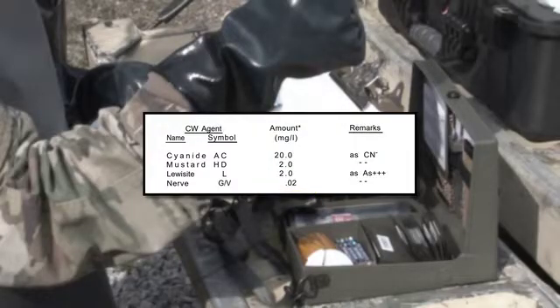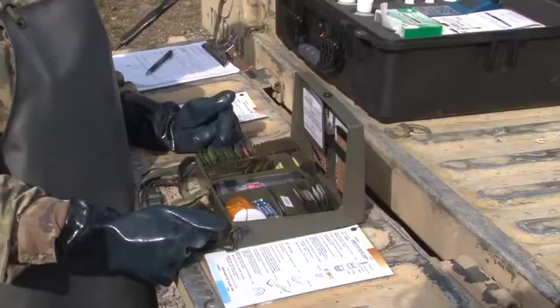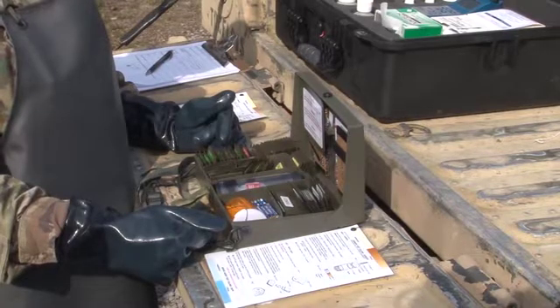Water containing agents in less than these concentrations is permissible for short-term use, up to 7 days, in cold or warm regions, with up to 5 quarts per person per day. You may ask, what if the CW agents are above the MPC, or maximum permissible concentrations, that we see on this chart? In that case, the water would need to be subjected to additional treatment processes and tested again. Remember, you play an important role in selecting the best water source for field water production in order to produce the safest and cleanest drinking water for the troops.